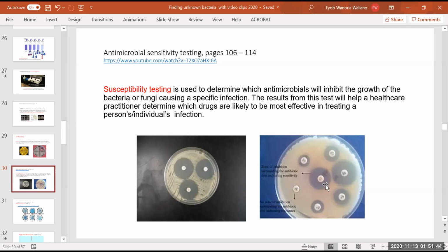The susceptibility test. So the doctor is prescribing you that kind of antibiotic, maybe to take 3 times a day if it's an acute case. If it is not an acute case, maybe 2 times a day. So to forecast this way, you need to know the inhibition test, how it works. So for this reason, we are going to test the sensitivity of antibiotics like this.